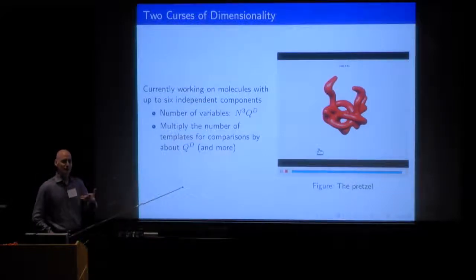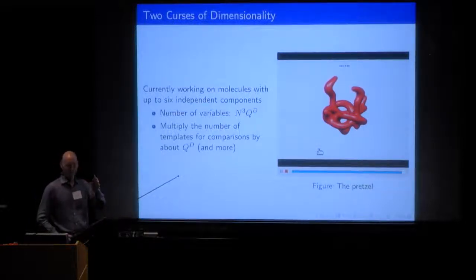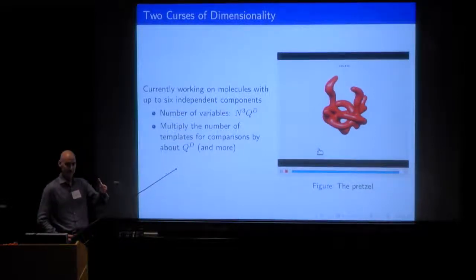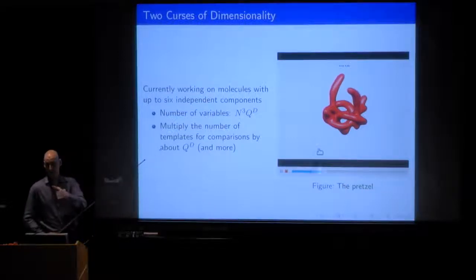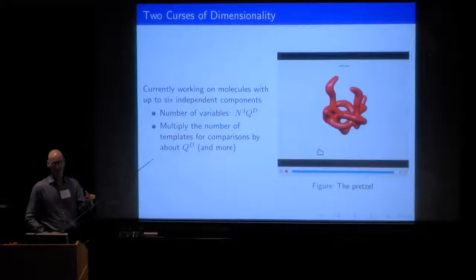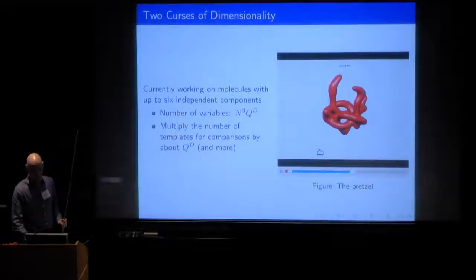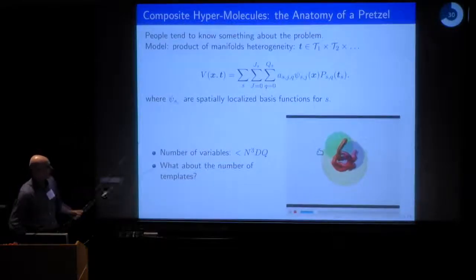Even if we had all the data in the world, if we're doing something like expectation maximization, technically in pure expectation maximization, what we're supposed to be doing is looking at every image, comparing it to every orientation at every state. And there are a lot of states. There's a computational complexity to it. And the answer is in the anatomy of the pretzel.